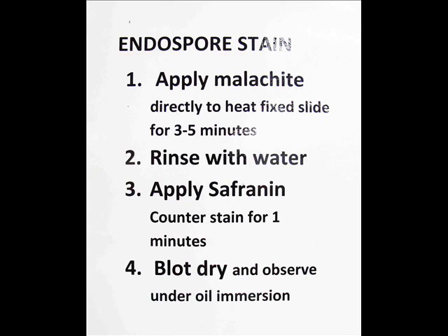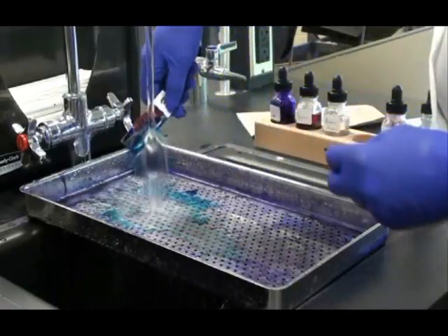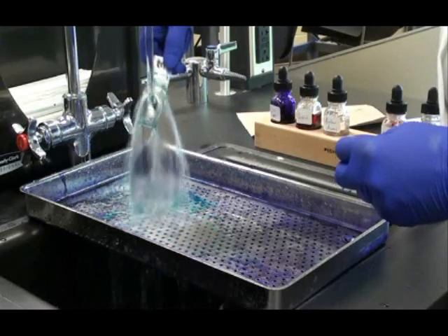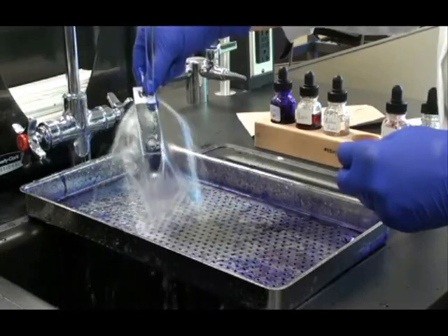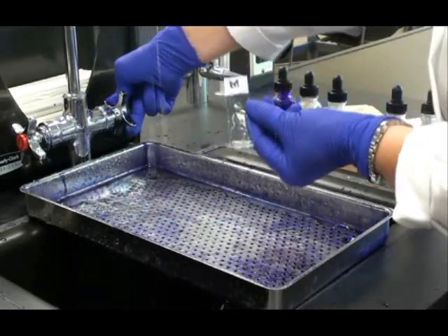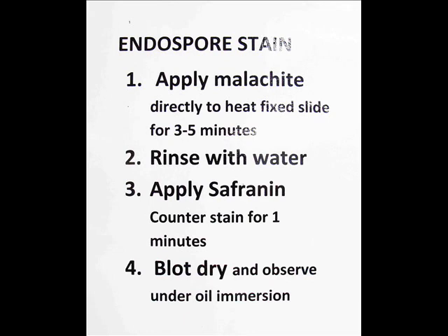The next step is to rinse the malachite green off the slide. After rinsing, I'm now ready to apply my counter stain, safranin.